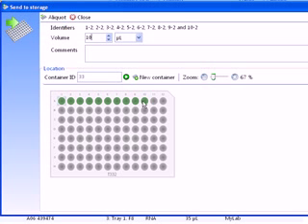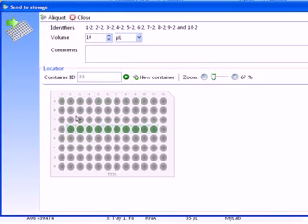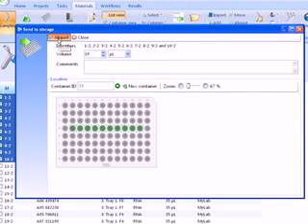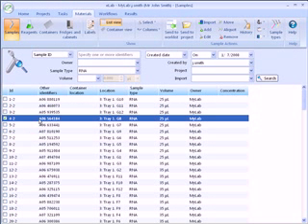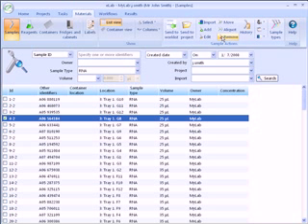We can modify the location of the samples as well. To remove samples, select them and click on the remove button.